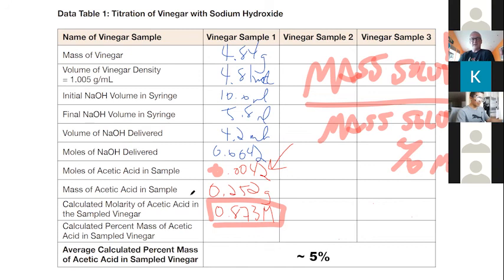We divide something by something else. Like moles over volume? That's right. We divide moles by what? Volume? What volume? It's a very specific volume. Volume of the solution? Right, the volume of the solution. What volume of solution? Like a quart, a gallon, how much volume?